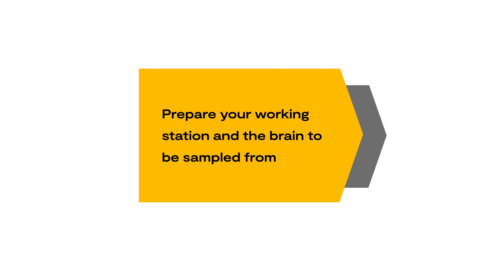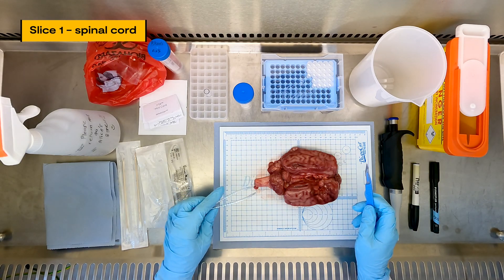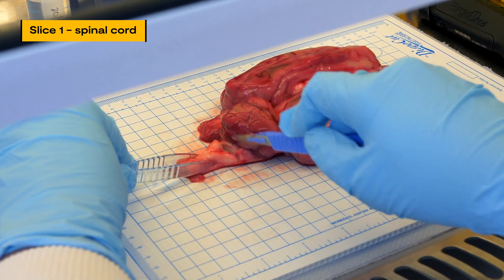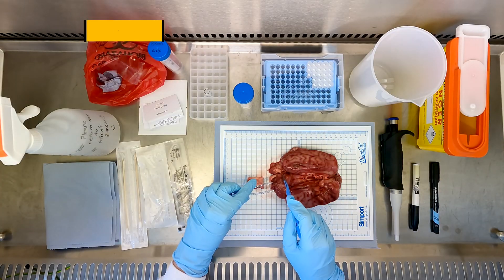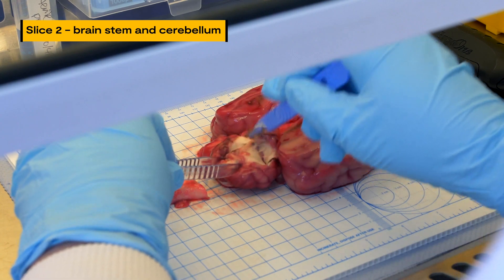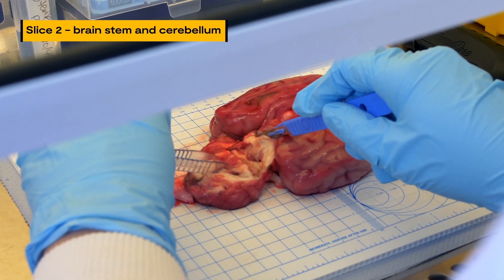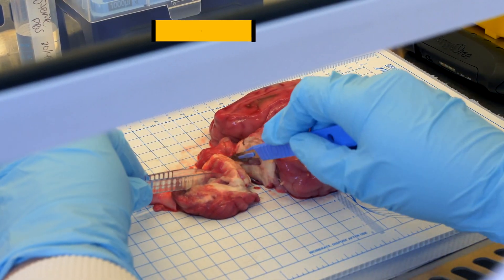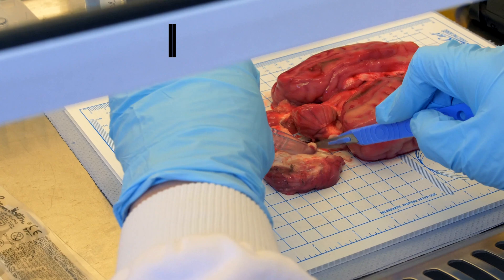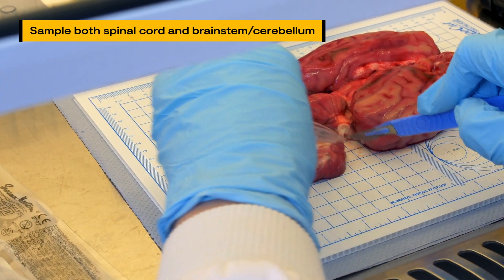Prepare your working station and the brain to be sampled from. Using a sterile scalpel and forceps, slice the brain in two areas: the first slice through the spinal cord, and the second slice through the brain stem and cerebellum. Cut tiny pieces of tissue from the spinal cord, brain stem and cerebellum. You need a total tissue of approximately one centimetre squared, which weighs approximately 50 to 75 milligrams.